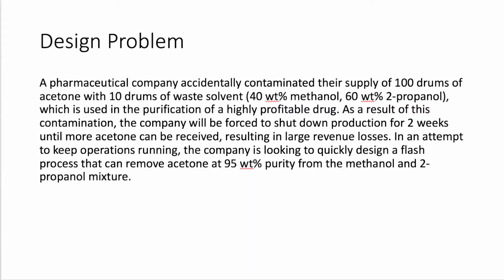For this lab, we were tasked with solving the following problem. A pharmaceutical company accidentally contaminated their supply of 100 drums of acetone with 10 drums of waste solvent, 40 weight percent methanol and 60 weight percent 2-propanol, which is used in the purification of a highly profitable drug. As a result of this contamination, the company will be forced to shut down production for 2 weeks until more acetone can be received, resulting in large revenue losses.